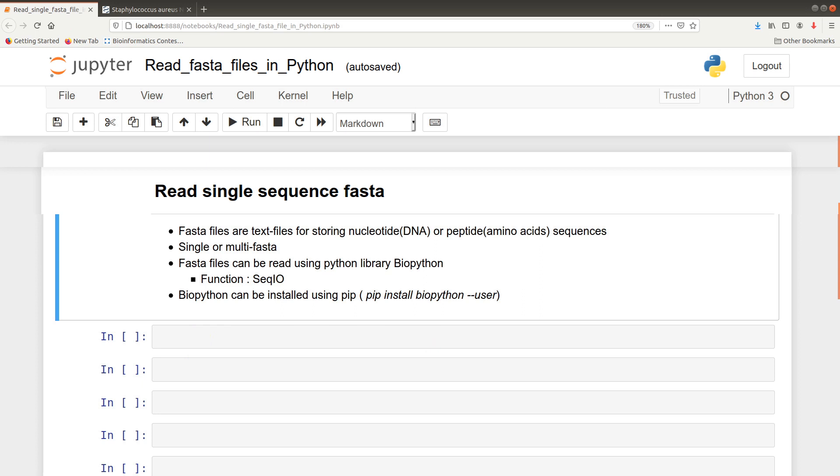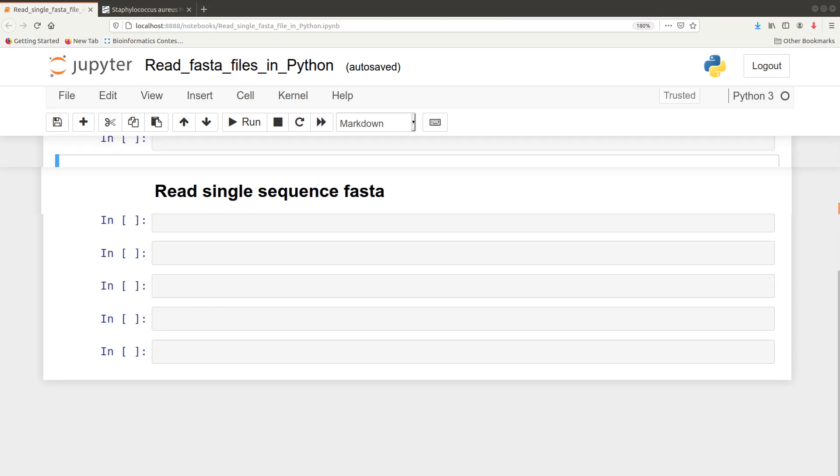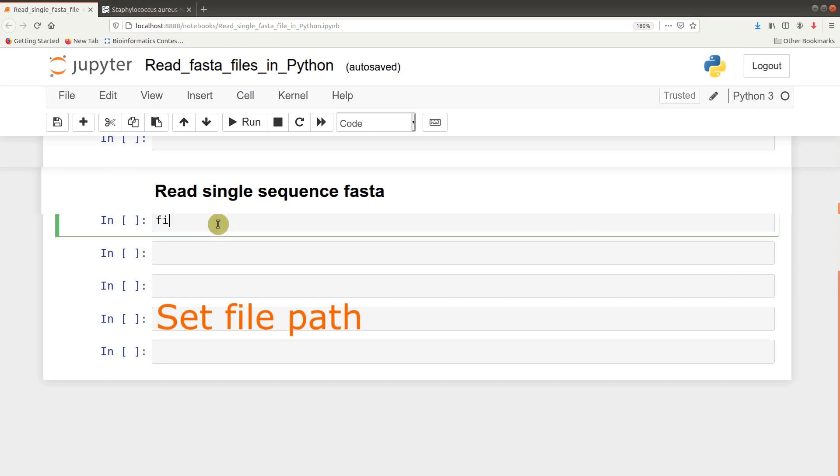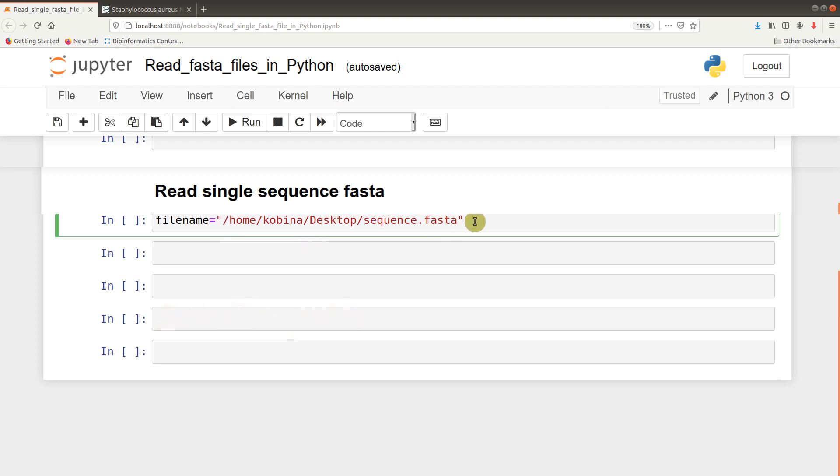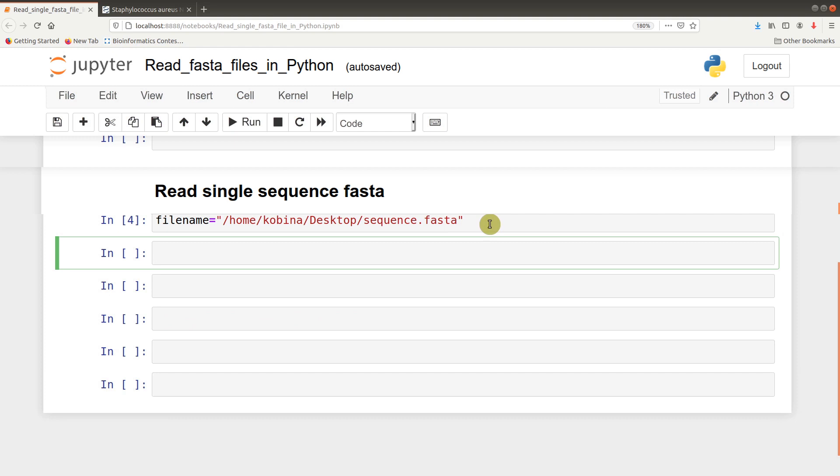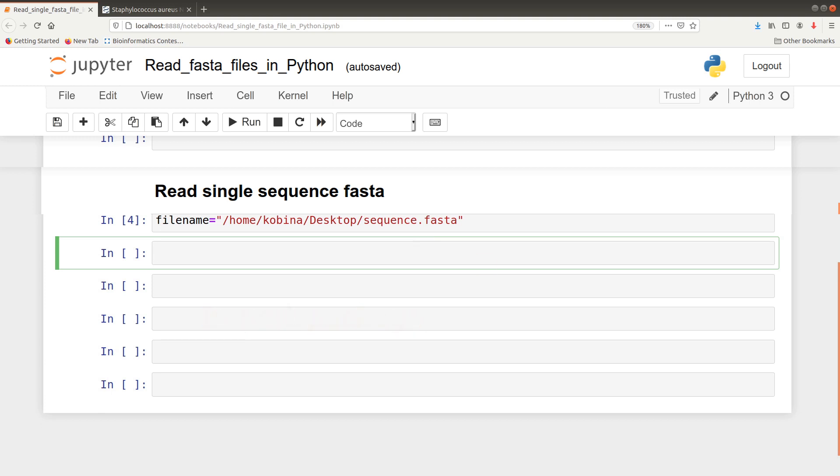Let me first define the header. To read it you first have to define your file name, the full path. This is the path to my file. After that, the next one is to import the BioPython library and then import the function SeqIO. We will say from Bio import SeqIO.